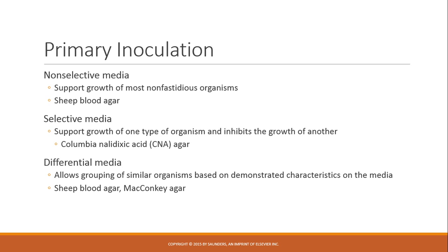MacConkey agar, we talked about this on the first day. We talked about lactose fermentation. MacConkey agar allows us to differentiate between gram-negative bacilli. Are they lactose fermenters or non-lactose fermenters?